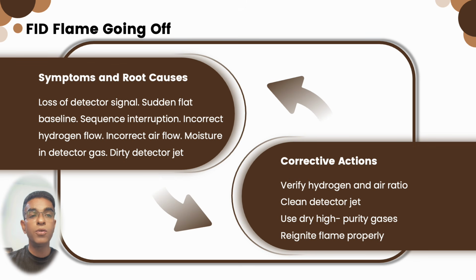To correct this issue, gas flow ratios must be verified according to instrument specifications. Detector jets should be cleaned periodically. Only high purity, moisture free gases should be used for stable flame operation.